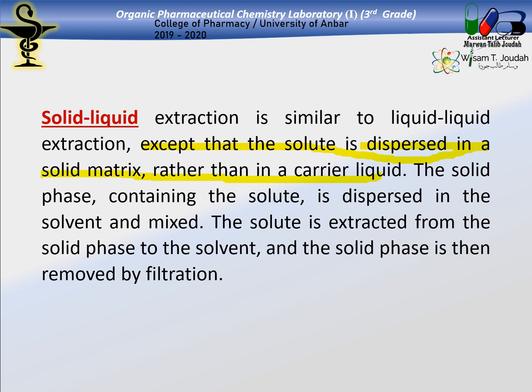The solid phase containing the solute is dispersed in the solvent and mixed. The solute is extracted from the solid phase to the solvent, and the solid phase is then removed by filtration, as we just mentioned.